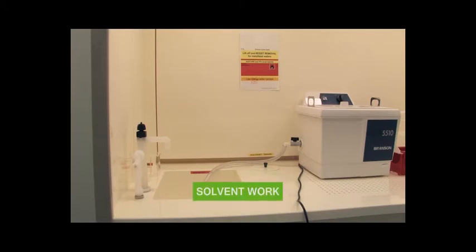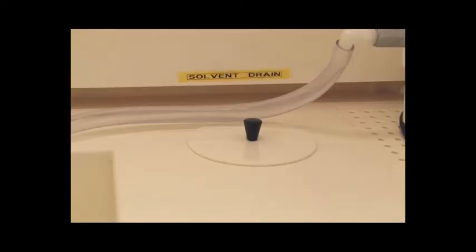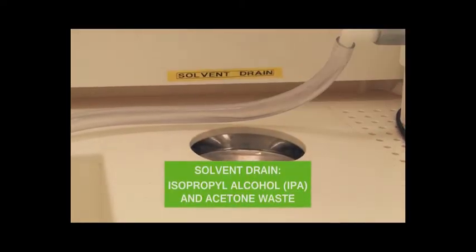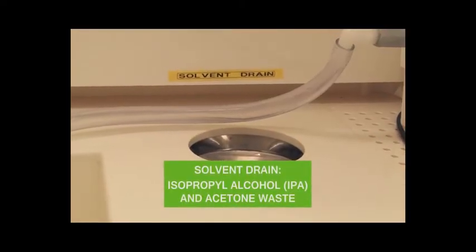The fume hoods and wet benches designed for handling solvents are equipped with solvent drains. Often they have a neutralisation drain as well for the disposal of rinse water. The solvent drain is primarily for isopropyl alcohol and acetone waste.